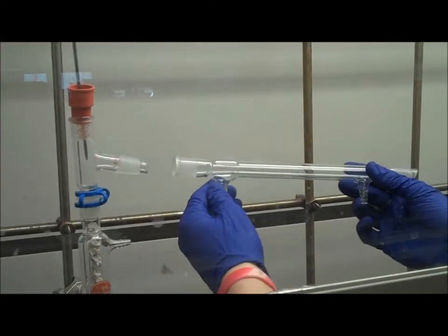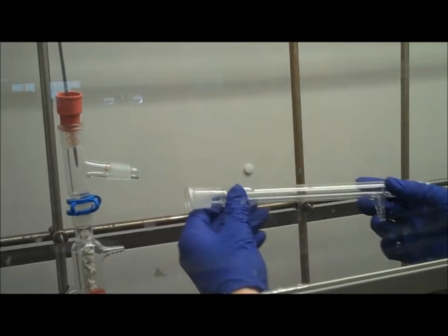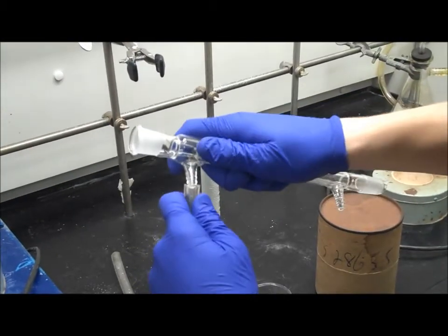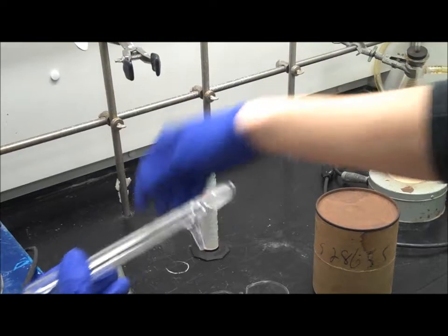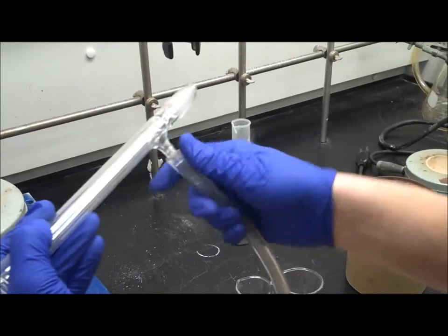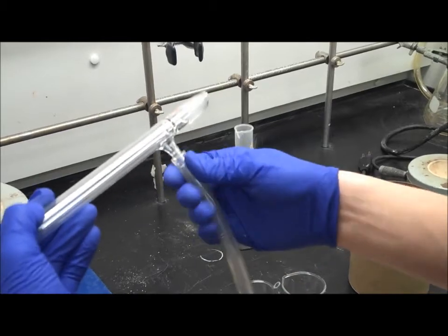Next, we're going to connect the condenser to the apparatus. First, we're going to connect two hoses. One hose is for water leaving the condenser, and the other is for water entering the condenser from the sink.